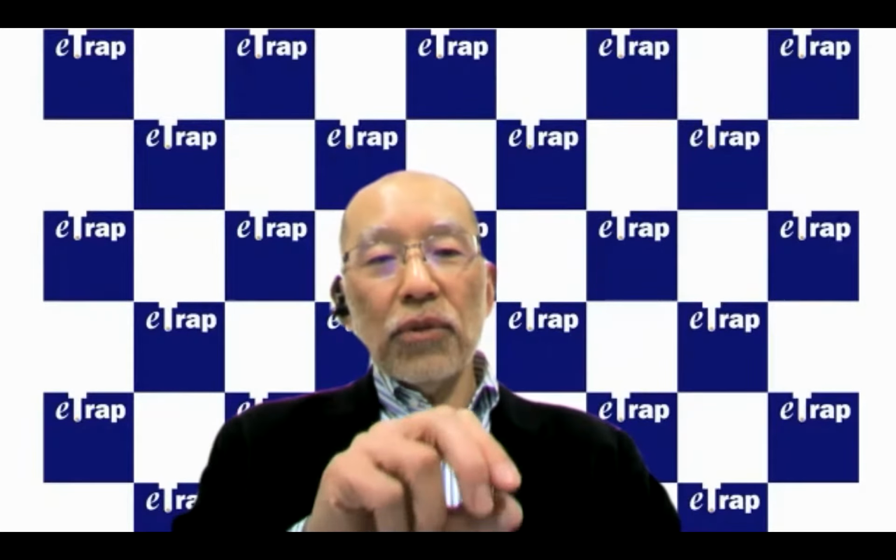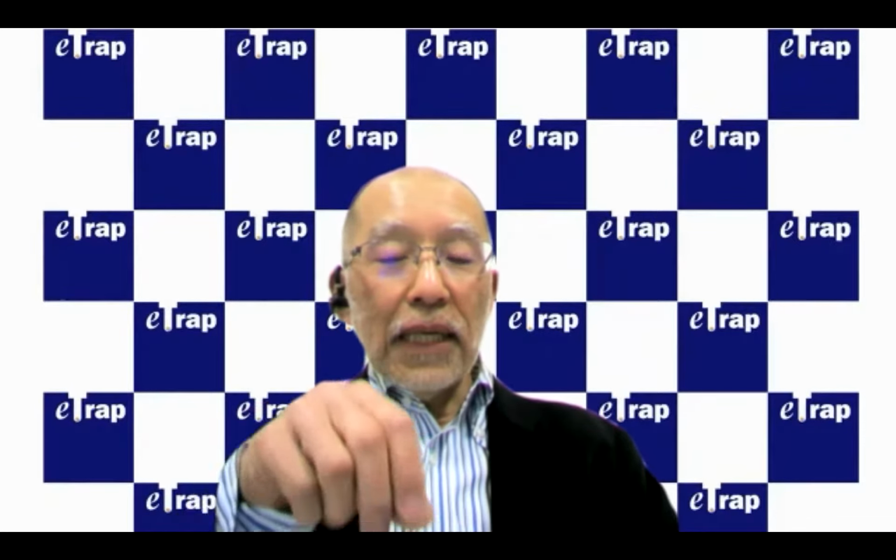Sometimes, for example, if the material contains organic residue on the surface, the electron traps are covered with that material and there are not so many peaks. However, by ozone treatment before measurement, such electron traps are sometimes recovered.